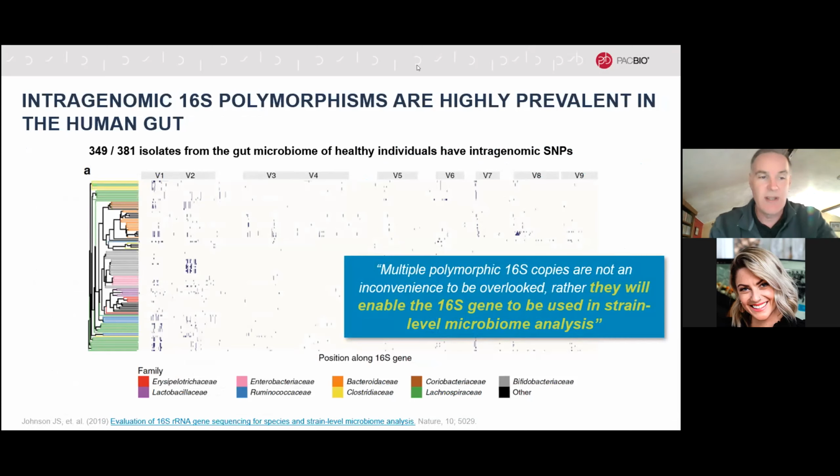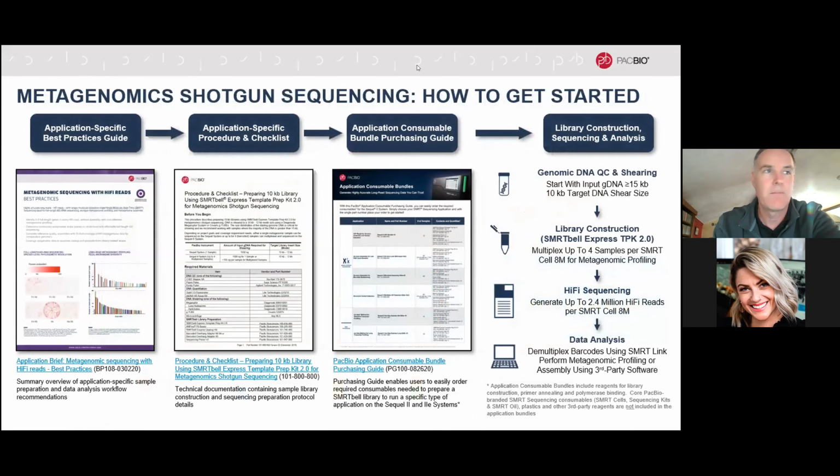This is not really so surprising, I guess, but the advantage is that if you're able to capture that information, you can sequence and get data that's beyond just the species level. You are getting down to individual strain identification levels. So whether you've got a virulent strain of the bacteria or something that's less virulent and not posing, say, a human health risk. You've also the ability to look at the gene function there and say, well, have you got antibiotic resistance or not? Those sorts of things. So it gives you a lot of power with the data that you recover.